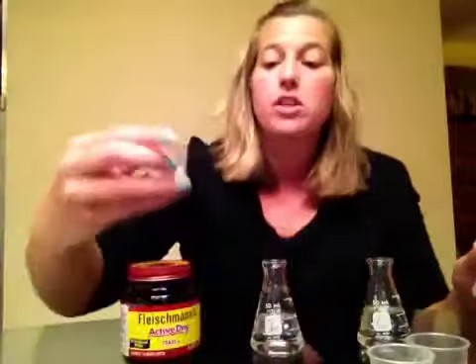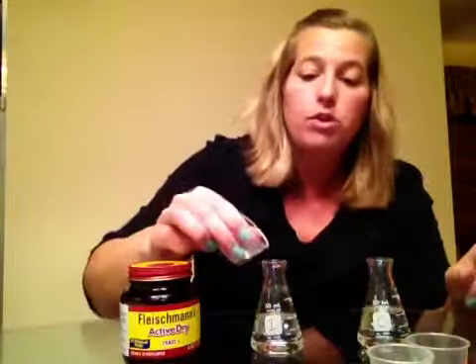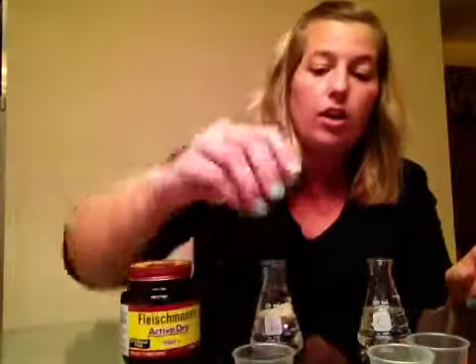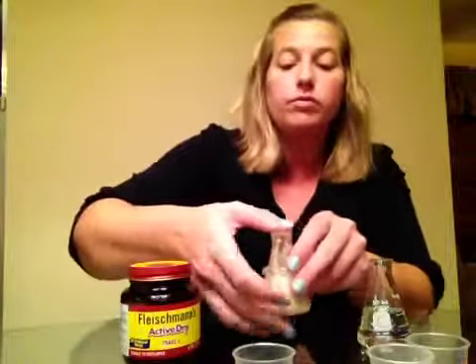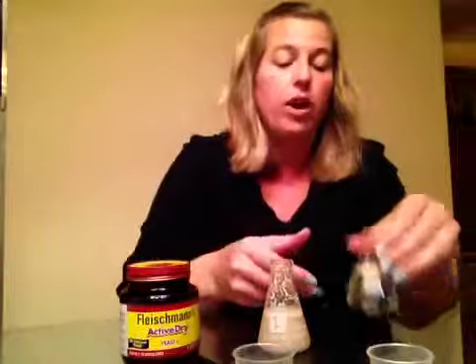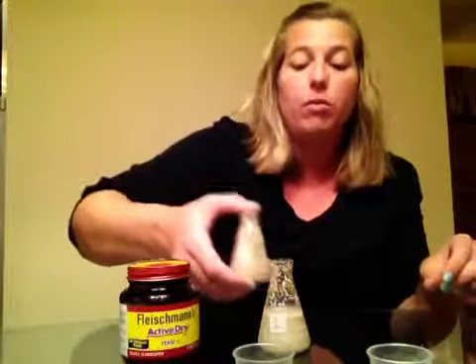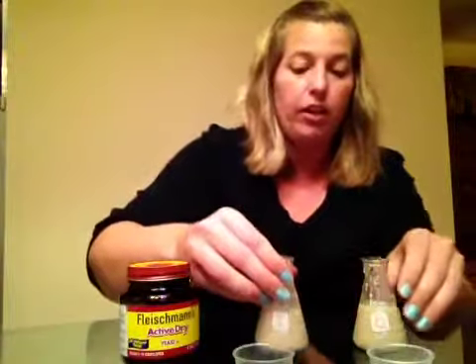We always want to use metrics in science, so I've measured the yeast, and we are doing 5 milliliters of yeast in both, and it's dry yeast, but the water's going to bring it out of its dormant state. And you can cap it with your thumbnail and shake it around. Okay, and then I'm also going to add my yeast to my control and shake it around as well. Milliliter shows volume, so how much space it takes up. So milliliters is good for liquids and the yeast as well, because it fills the container, so it's easy to measure.